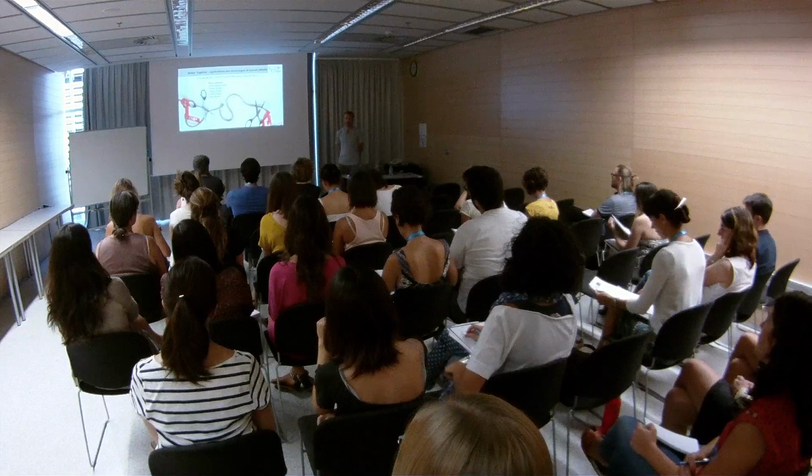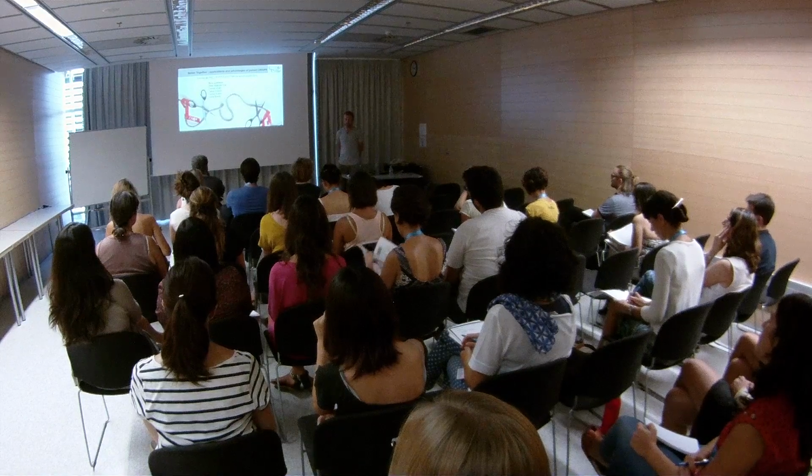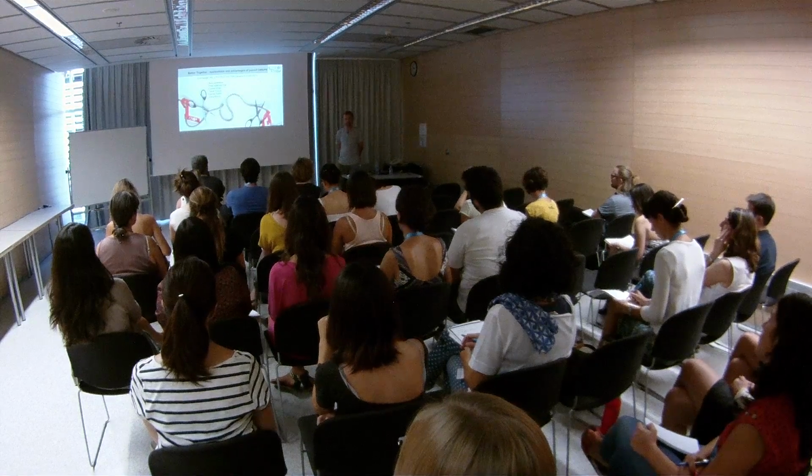And so what I'm going to show you is a series of tools and experiments and assays that we've set up where we've been trying to adapt CRISPR to quite a specific but I think important problem of how we can knock out non-coding elements in the genome. So most of the people began using CRISPR to knock out protein coding genes, and our main research interest is non-coding elements, and we have come up with a way that we think is quite versatile and powerful for deleting almost any non-coding element in human cells.